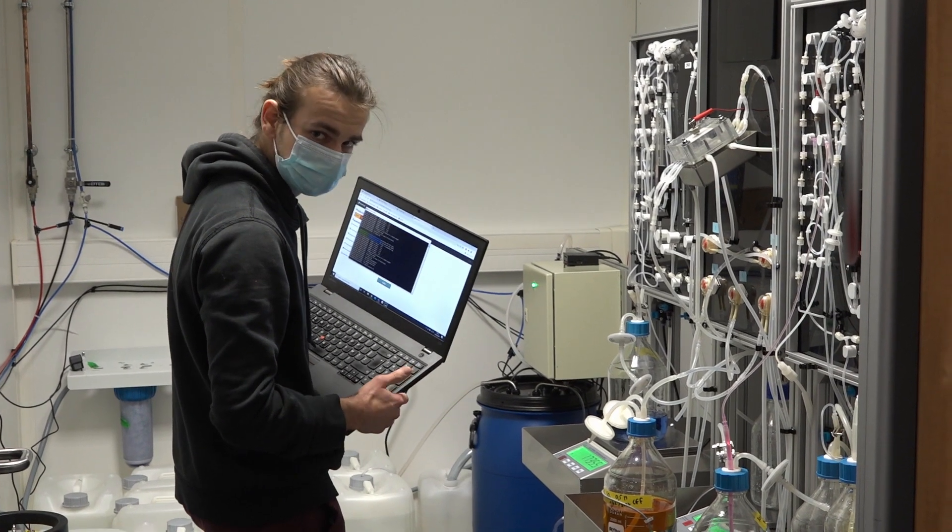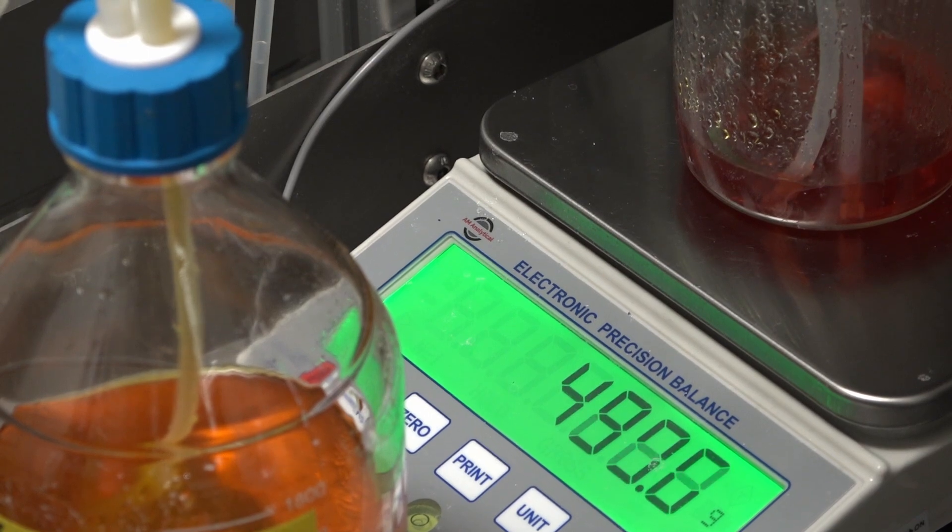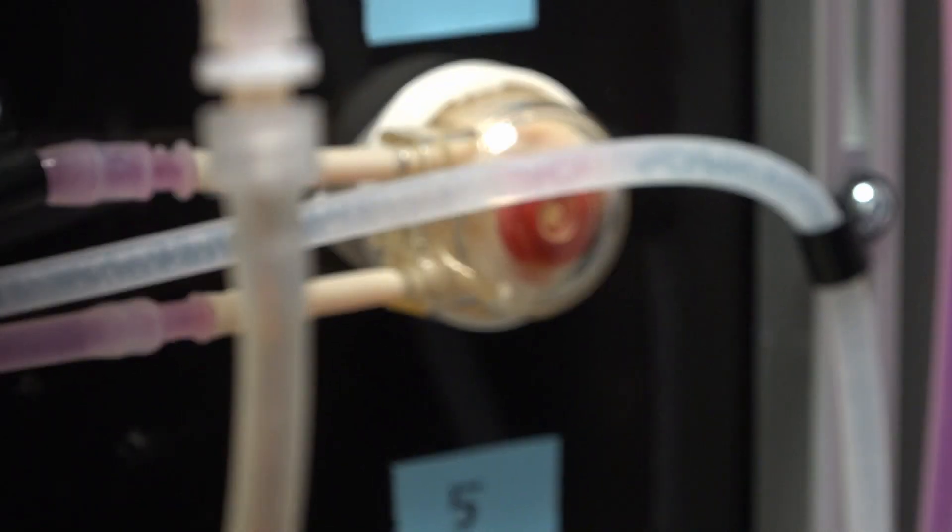Altar is a French biotech company that developed a special method to optimize bacterial strains for this task.